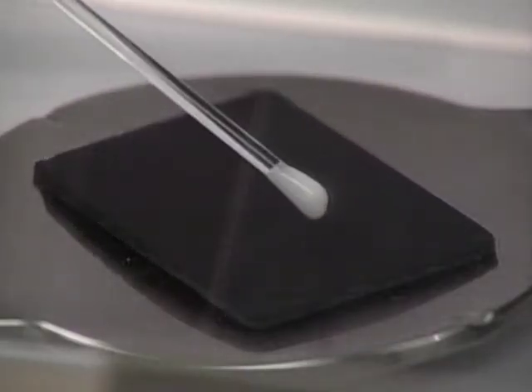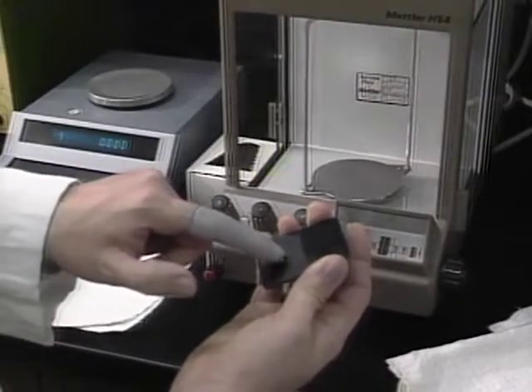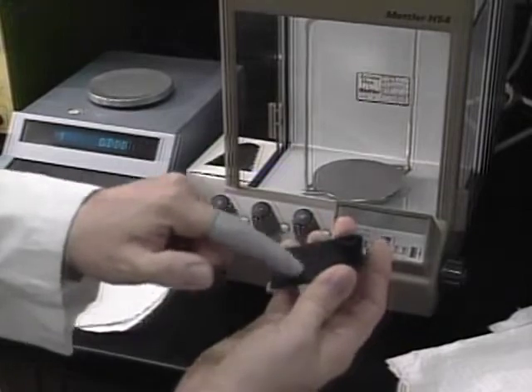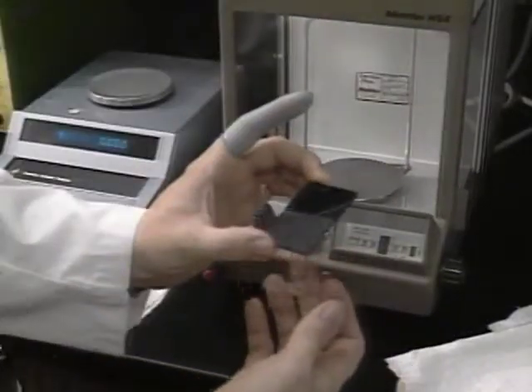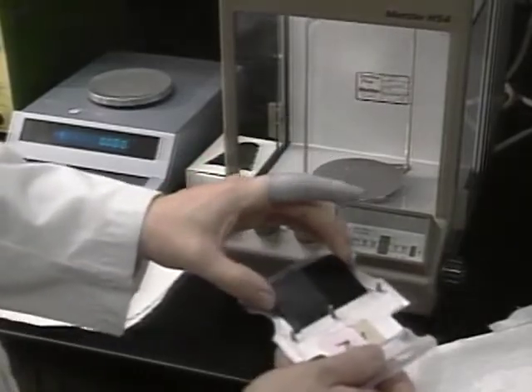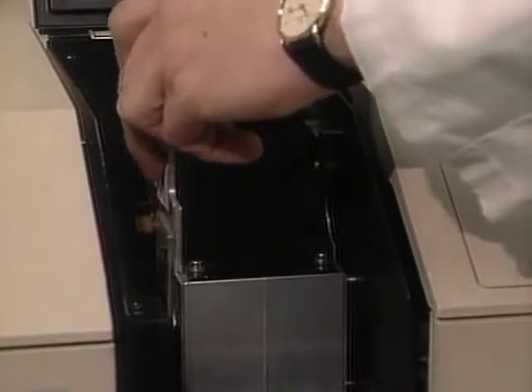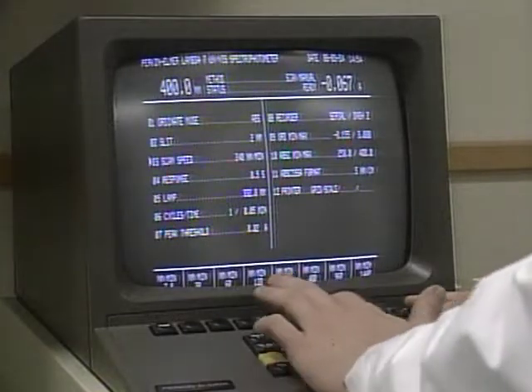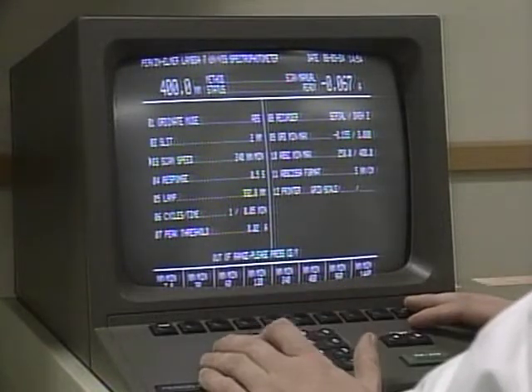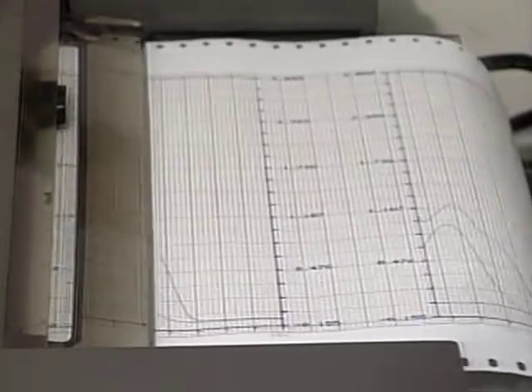A carefully measured amount of sunscreen is first smeared onto a rectangular block made of protein. The protein chemically simulates human skin, and the thin layer represents a typical application of sunscreen on it. The material is then placed in a spectroscope. The device sends ultraviolet radiation through the sunscreen layer and measures how much of it is absorbed by the molecules.